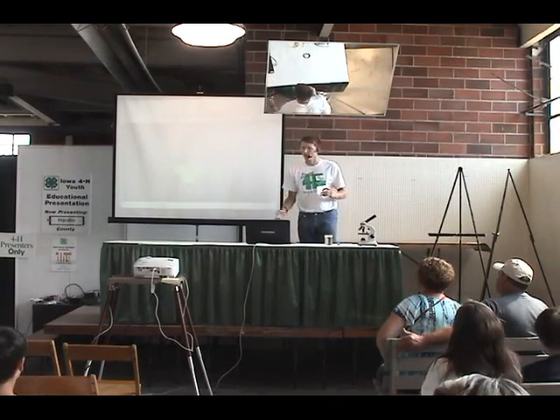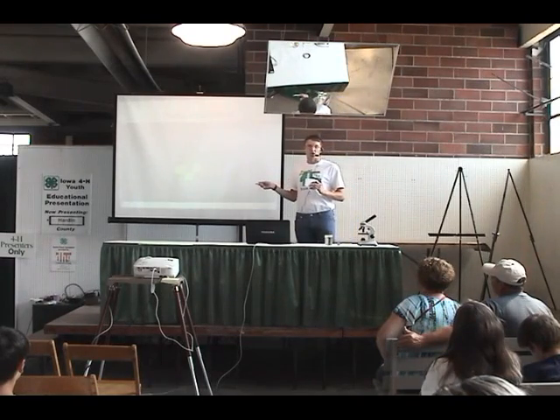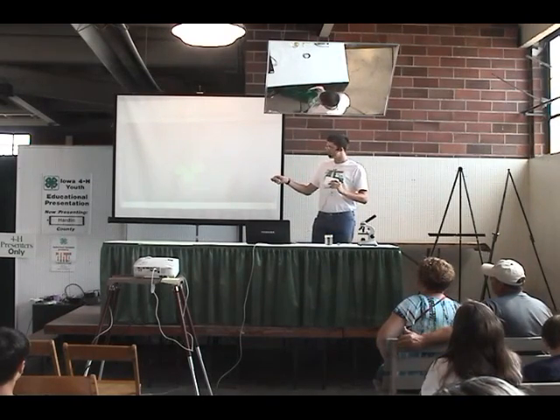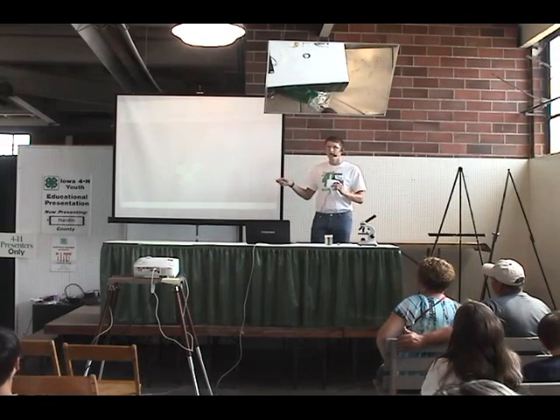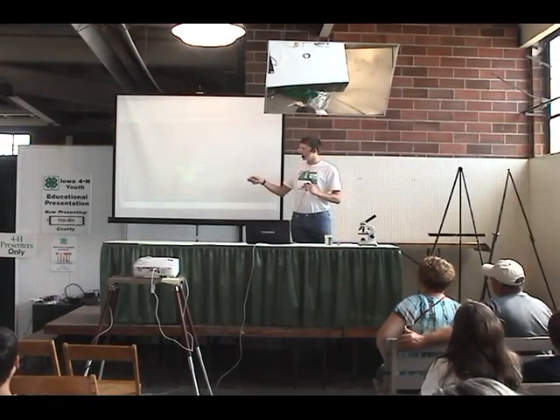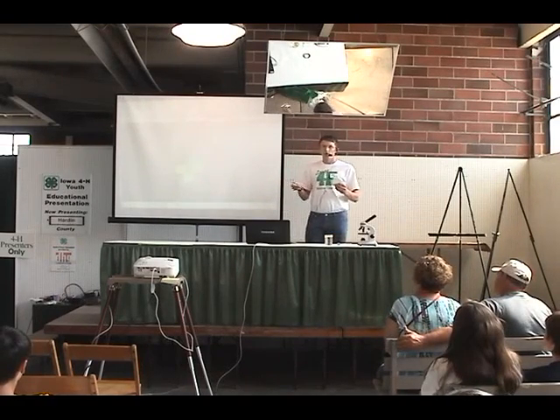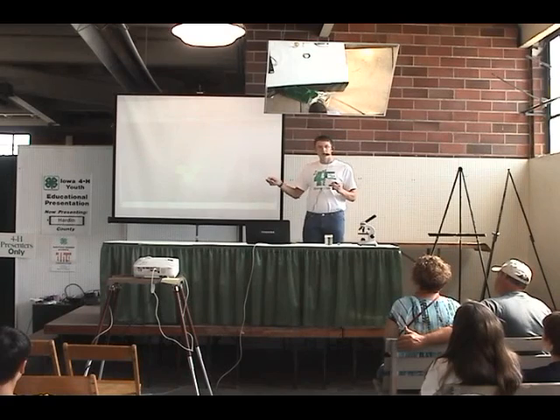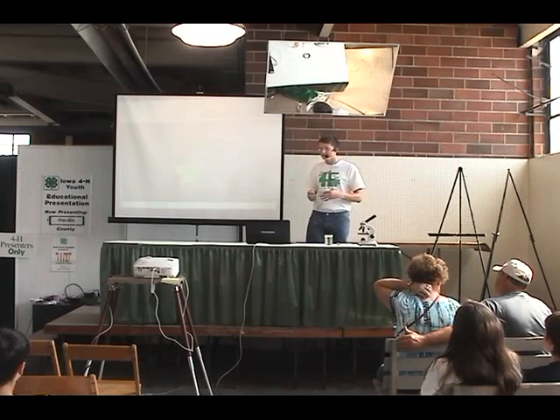And finally, there's the volvox, which is a type of algae. It's actually an algae colony. If you look closely on this sphere, you can see each one of these green dots is an individual cell. And these smaller spheres are the daughter colonies. And so it reproduces by making these daughter colonies. And when the parent colony dies, it will rupture and let these daughter colonies out.